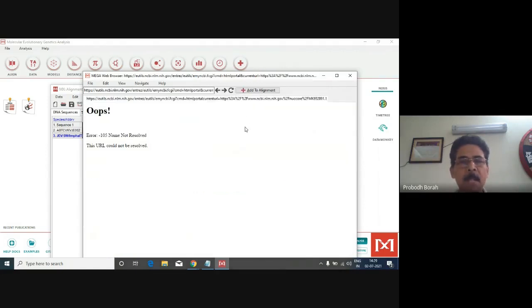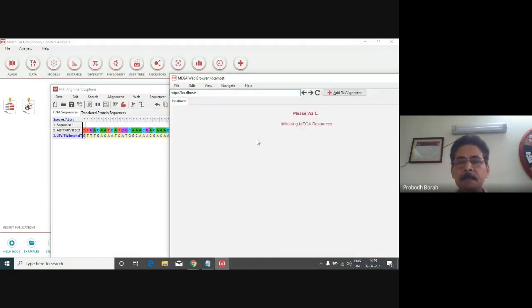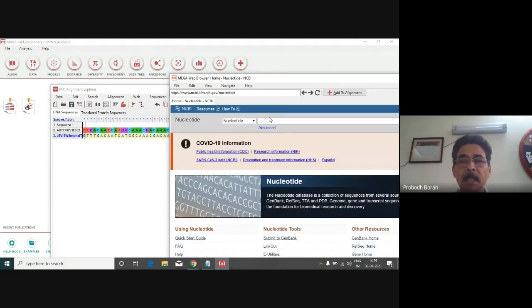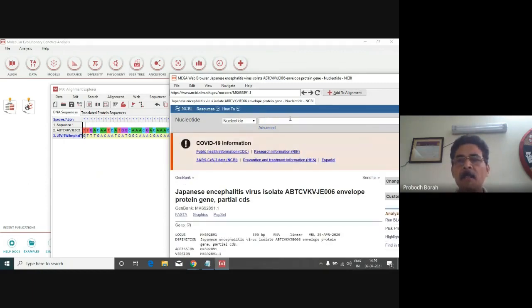It is taking some time. Okay, it has not been completed. So we'll refresh this page. Let us see. So there is some problem. We'll close it, then come from web once again. Go to web, then query GenBank. Here we will search once again. Okay, now it has been downloaded.